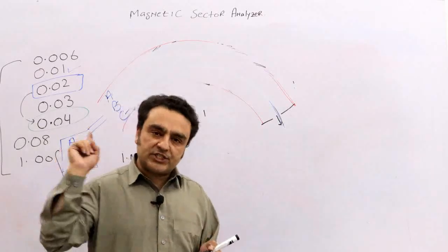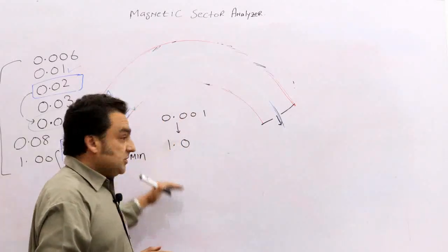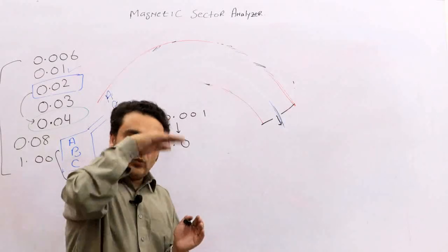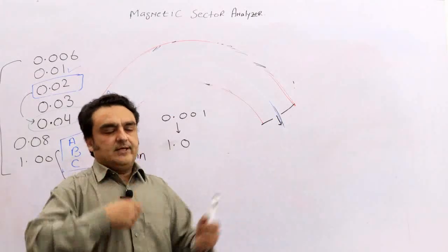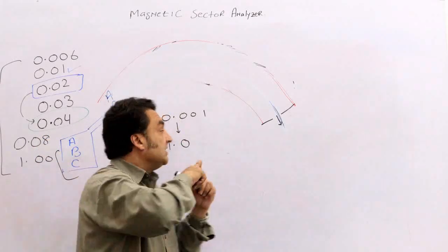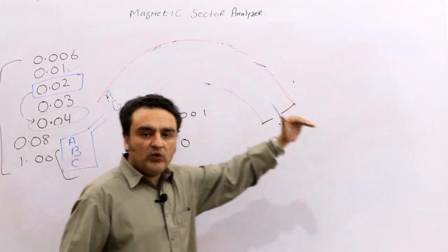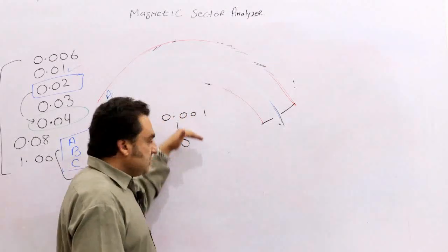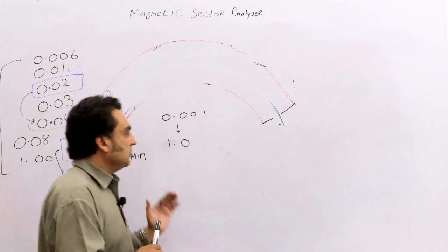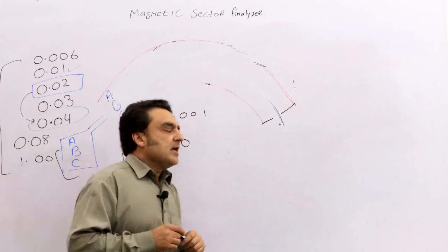So this shows one thing, that the ions move extremely fast. Look at the magnetic field, it is increasing or decreasing, suppose 10,000 times in 1 minute, but still the ions are very much faster. These ions are moving so fast that this scanning time is slower for them. So each one makes it through to the detector.